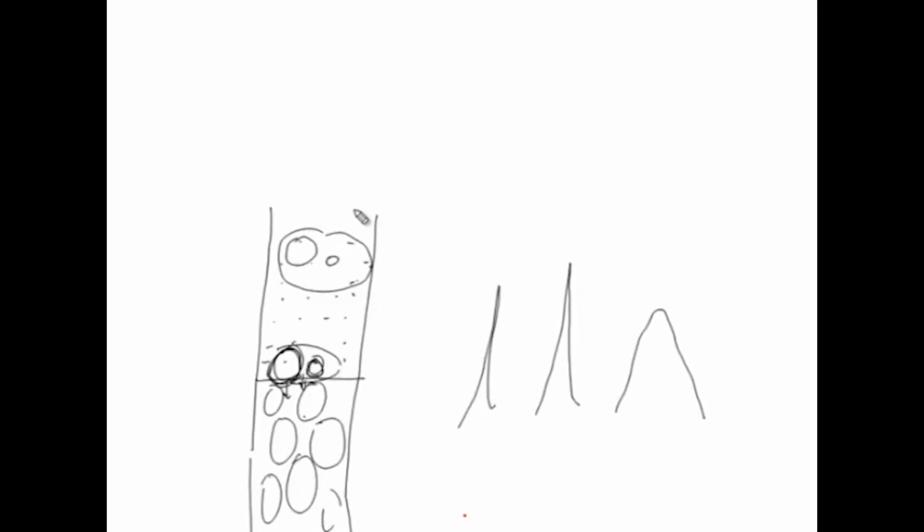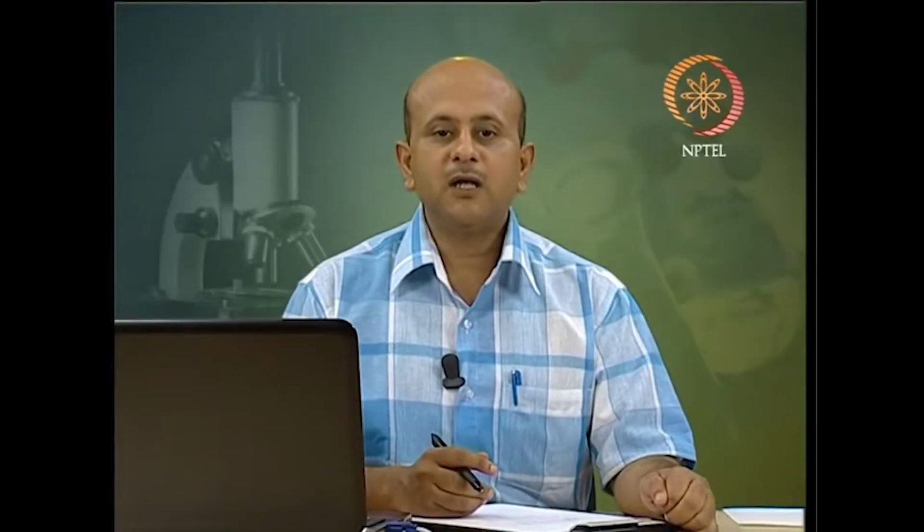And the problem is, because these will be entering at different times, the purification will not be proper. So, it is very important that the sample is applied in a very small volume, so that almost all analytes enter the gel at the same time, and then they separate according to their retention times, actually retention volumes, as per their molecular size. So, that is a very important factor which needs to be looked into.